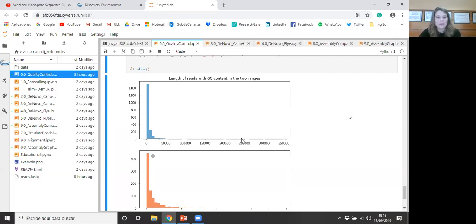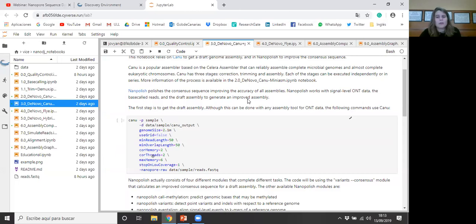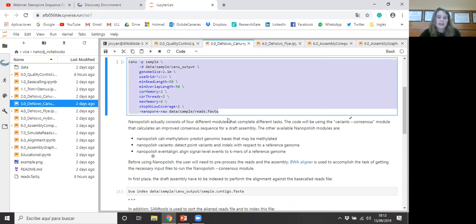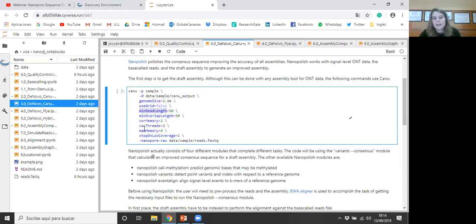Once the quality control step has been done, we will go to the de novo assembly notebook with Canu and Nanopolish. In this notebook, Canu gets a draft genome assembly and Nanopolish improves the consensus sequence. Canu is a popular assembler modified from the Celera assembler, which is based on the overlap-consensus method. For example, it can assemble a complete microbial genome and almost complete eukaryotic chromosomes. Canu has three stages: correction, trimming, and assembly. With this command, we can get the draft assembly with Canu. In this part you can provide your FASTQ input file, and then you can add more information if you want — for example the genome size if you know it, the minimum read length to use in the assembly process, and the memory and threads, among others.